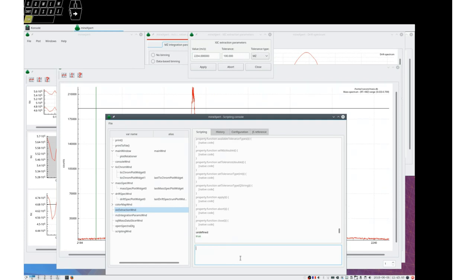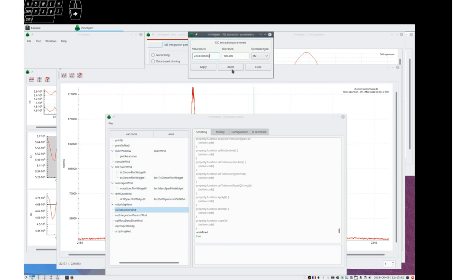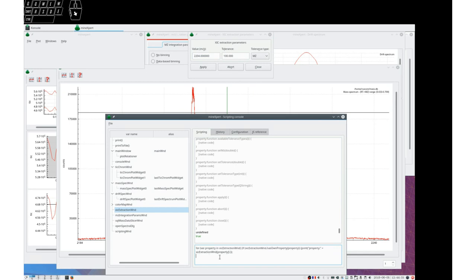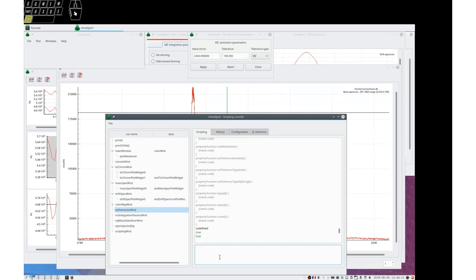Set MZ 204. Right. And you see that it appears. And then we want to set the tolerance type. Set tolerance type. And we can set to MZ.